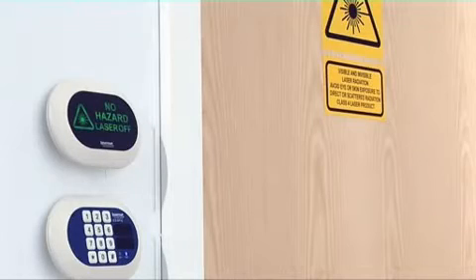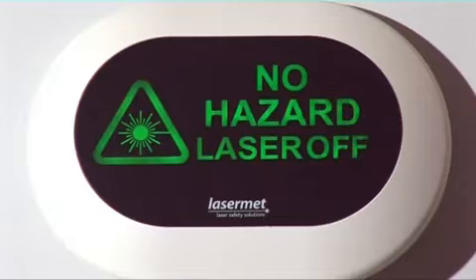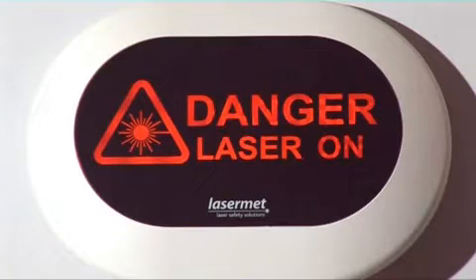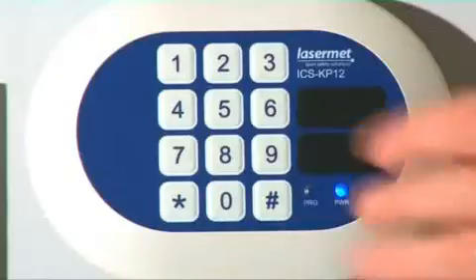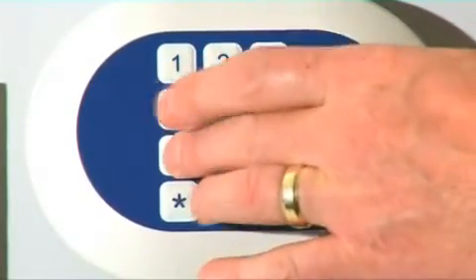On the outside of the door is situated a compact LED sign with three discrete modes: off, green no-hazard message, and red danger laser radiation message. Also outside the door is a keypad for secure operation of interlock override.